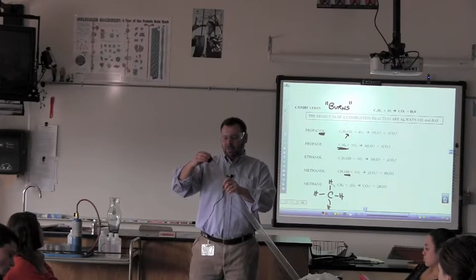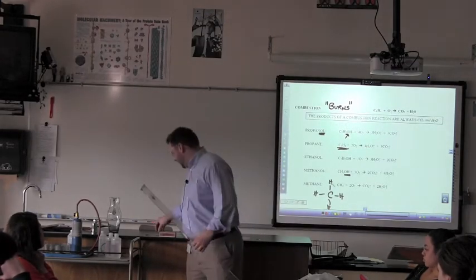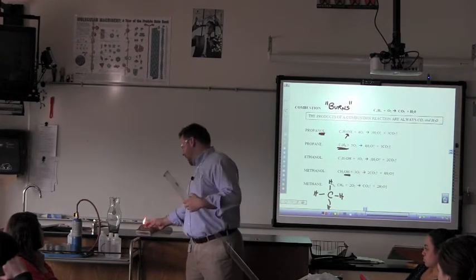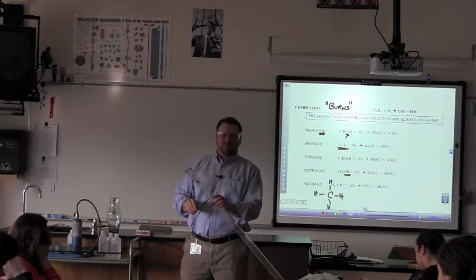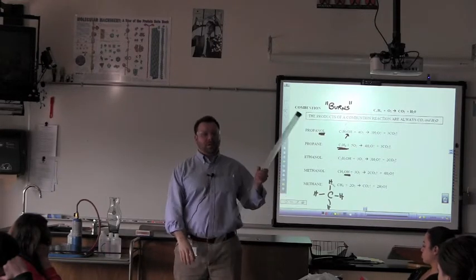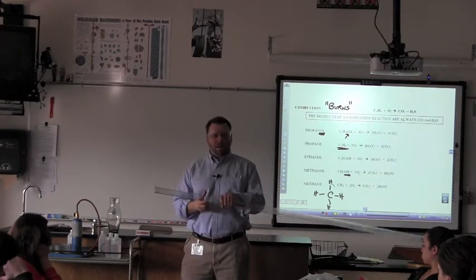Now, what about CO2? Well, maybe we'll try this again and see what happens. I'm assuming there's still enough methanol in here that it won't be a problem. But this time, the chamber's filled with too much what? Yeah, it's filled with too much CO2, so the combustion stops before it even starts. So let's clean that out a little bit.